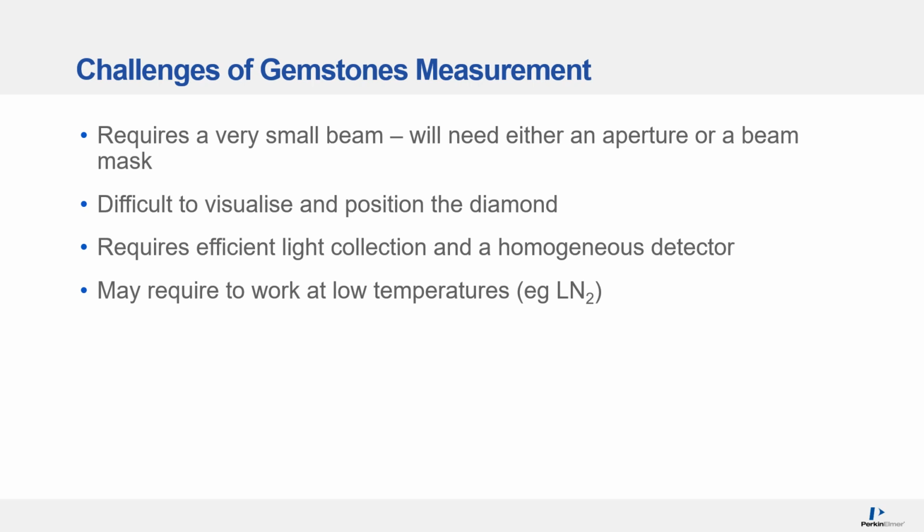The challenges are exactly the same as the challenges we faced in FTIR, mainly related to the small size of the sample compared to the optical beam size of the UV-Visible-NIR instrument. These instruments adopt a similar approach in using a beam condenser optic to reduce the beam size to match the small size of the gemstone.